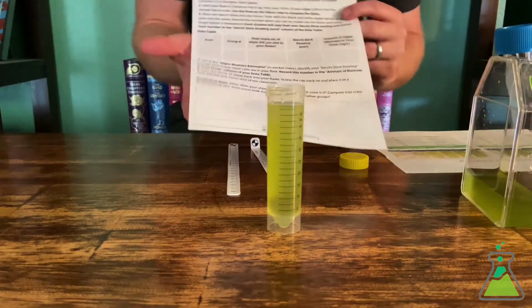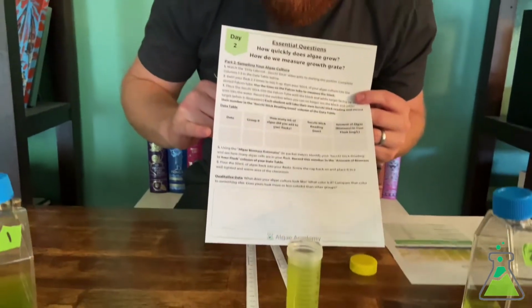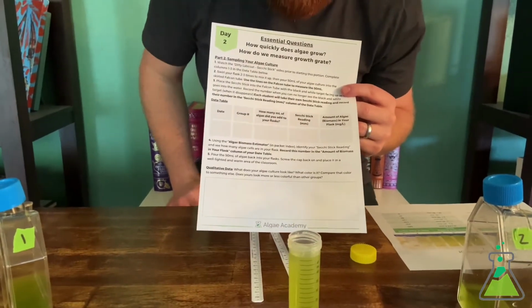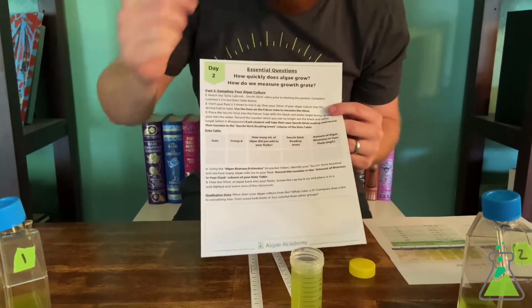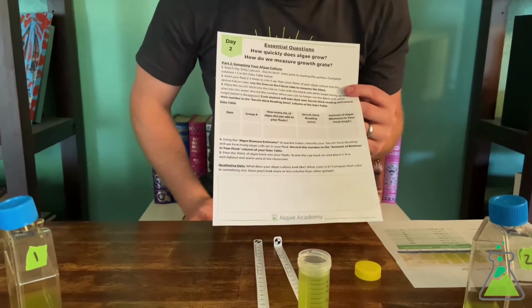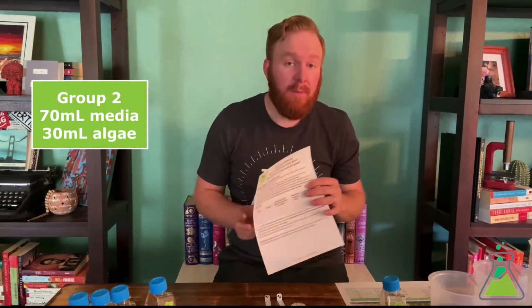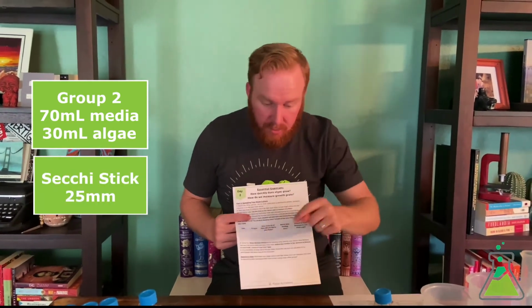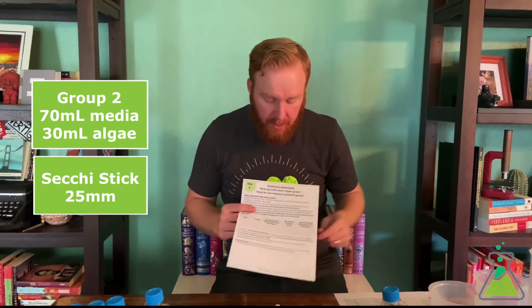So on our worksheet then, you go ahead and fill out the date that is today. You are group number 2. And then if you think about just a few minutes ago, we set up our culture. And do you remember how much algae we actually added to the culture? So we added 70 milliliters of media, and we added 30 milliliters of algae. So you can go ahead and write 30 in that box there. And then the Secchi stick reading, which we just took, was 25 millimeters. So make sure you document that as well.